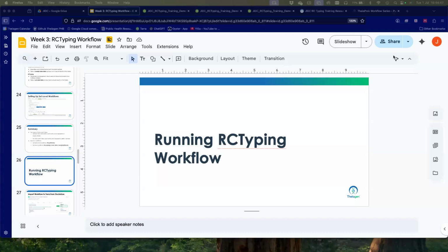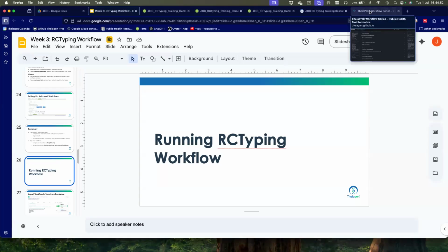It's just that at this point I am not aware, but I do know, within the Theiagen ecosystem of workflows, we have that zip column content, which will zip it, and then you can download the whole set of files with one download, and then you can process it locally and then upload again. So that's what I was able to do.